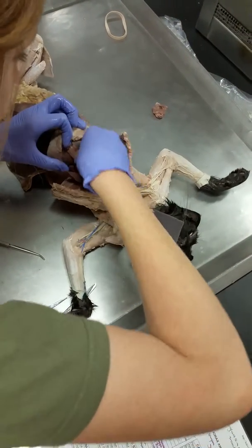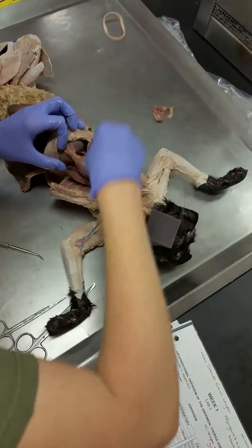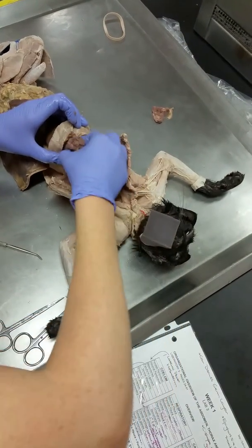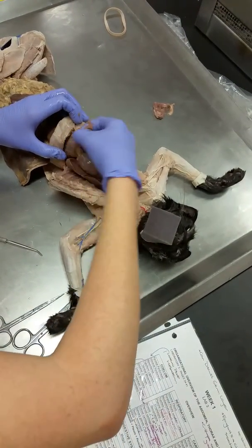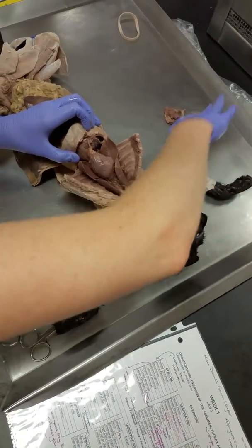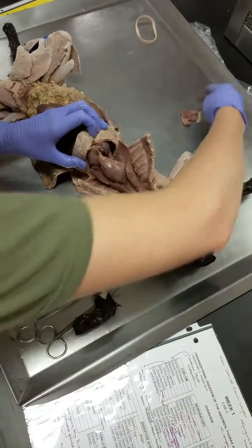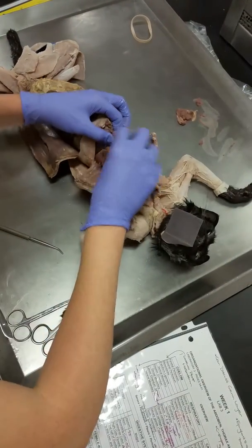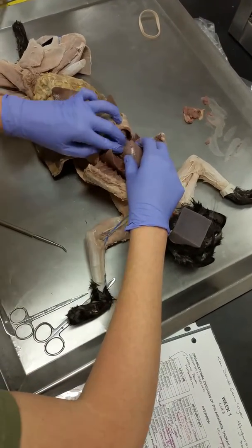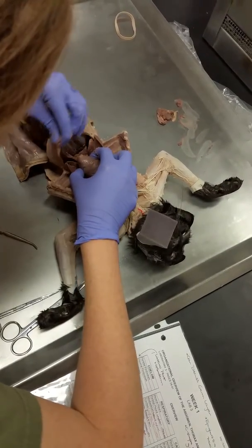It's really gross. You'll probably have dried blood in there too. That's gushy, dried blood. All of this is dried blood right here. Or congealed blood. It's gross. I know it. There you go. Okay, now what we're going to do is we're going to dissect the heart out of its pericardium.